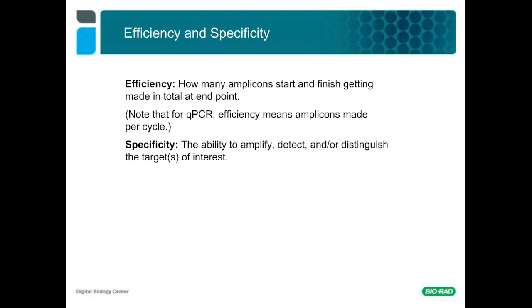This can also be true when encountering sample-specific PCR inhibitors. One of the most important things you can do to ensure the best efficiency for your assay is to digest outside the amplicon with a restriction enzyme. I will show examples as well as provide protocols at the end of this presentation. Specificity is also important and can be verified first using bioinformatics and finally empirically using a temperature gradient.